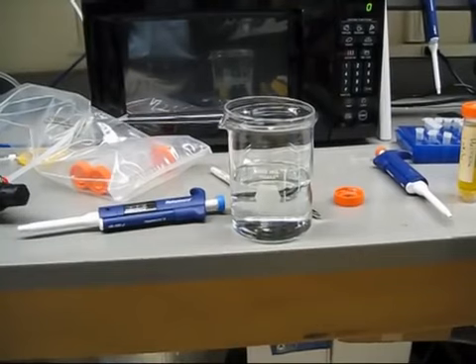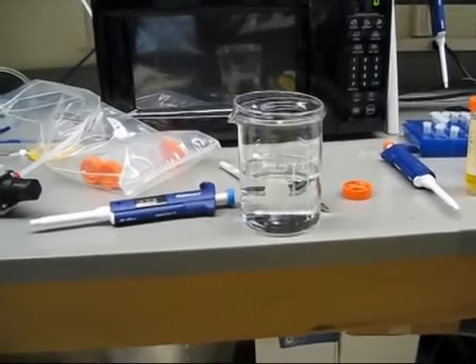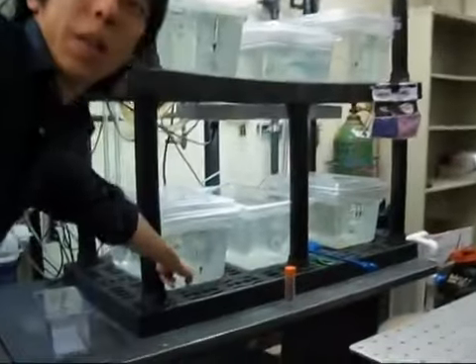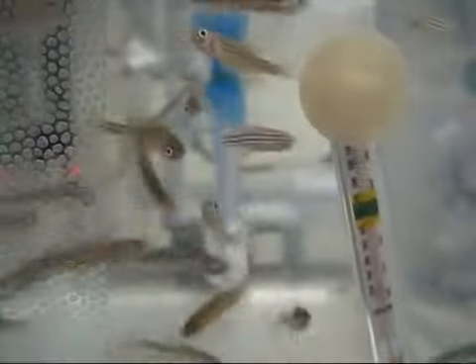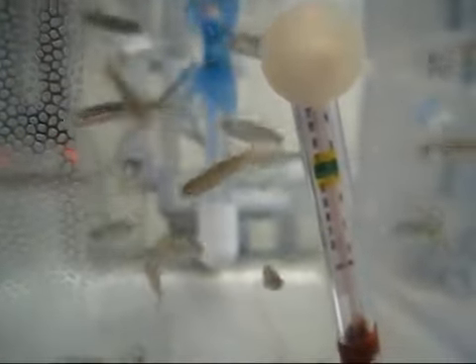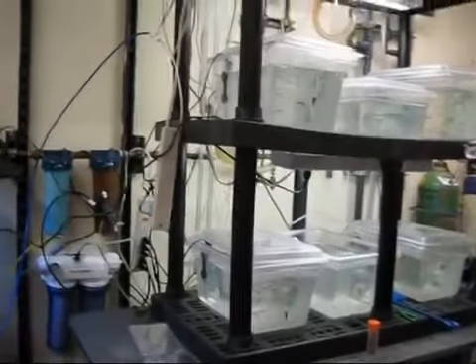Brain cells — they have maybe tens of thousands. Eventually they'll get kind of big. These are maybe one week old.